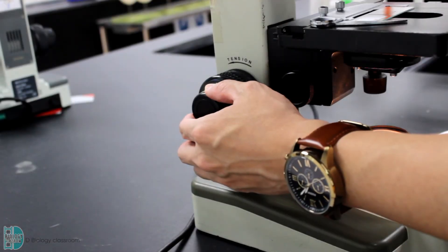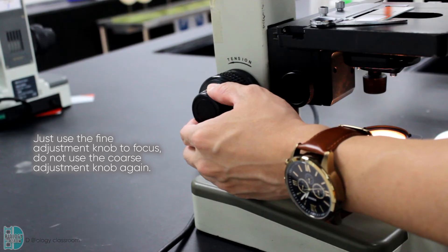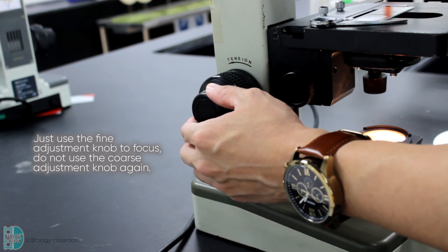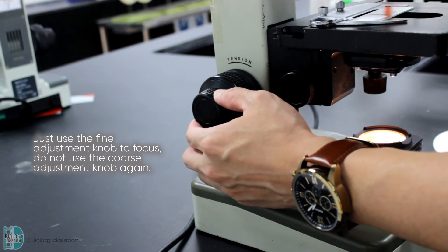Now, use the fine adjustment knob to focus and create a sharp image again. You don't have to use the coarse adjustment knob as you only need to have very fine movement of the stage.